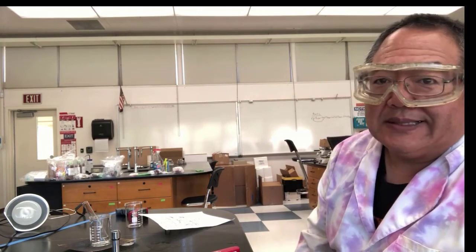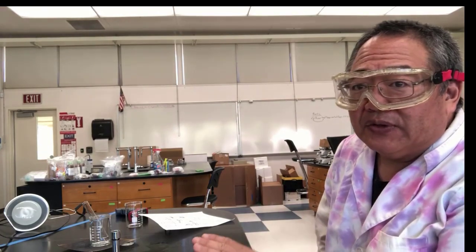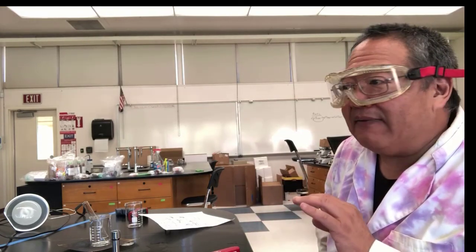The other really important thing to do, which would have been fun to do, but like I said, it's dangerous: don't use flammable liquids when you're using a fire, okay? There are times in organic chemistry where flames are used, but it's under very specific and controlled instances. We will have flammable liquids in the room, so if you're heating with an open flame, that's what we refer to as an open flame, make sure you don't have any of the flammable liquids around you.